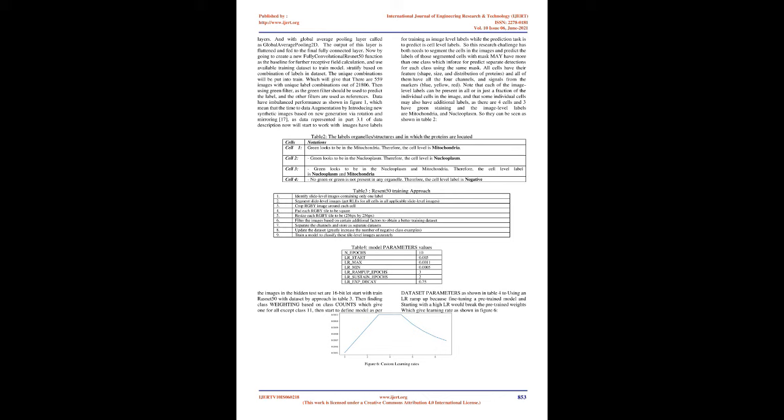Nucleus and nucleolus are patches of similar size. When the characteristic crescent shape of the nucleolus is not showing, it is also difficult to distinguish from the nuclear marker. Overall, the single-cell accuracy of 91% is approaching the protein compartment assignment performance of previous reports. The success of ResNet deep neural networks in image analysis relies on architectures that encapsulate a hierarchy of increasingly abstract features relevant for classification, and plentiful training data to learn the model parameters.